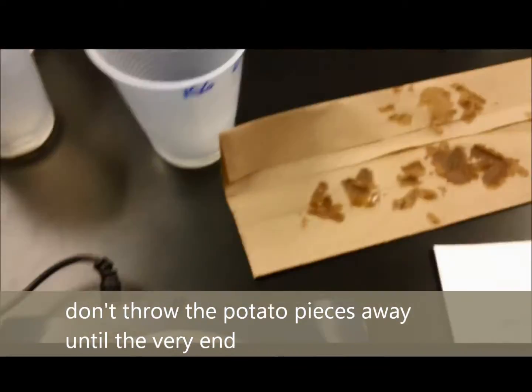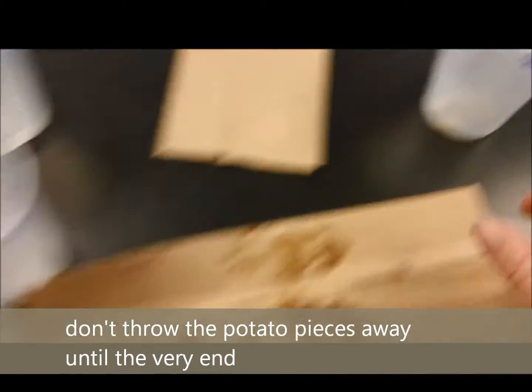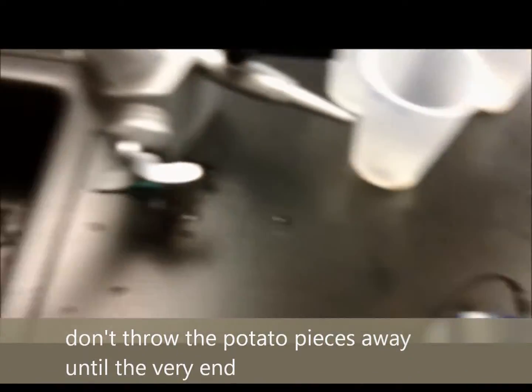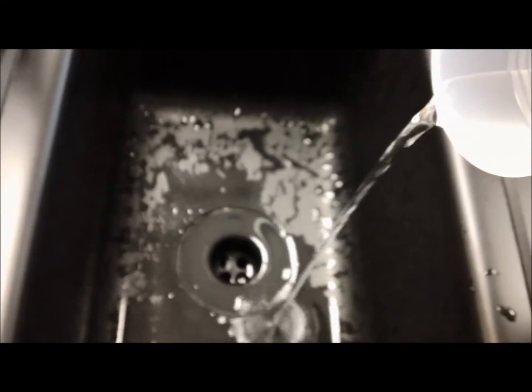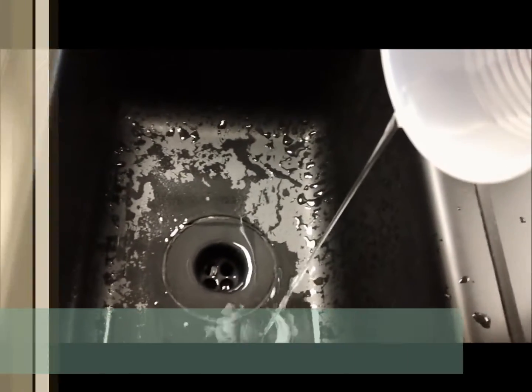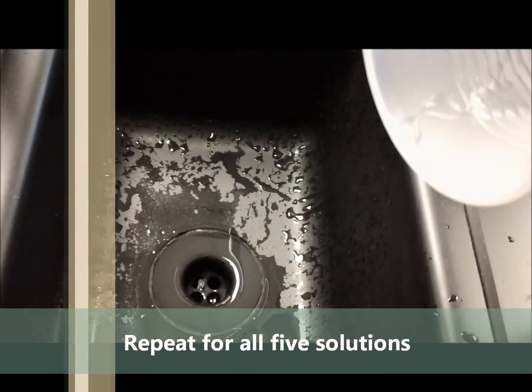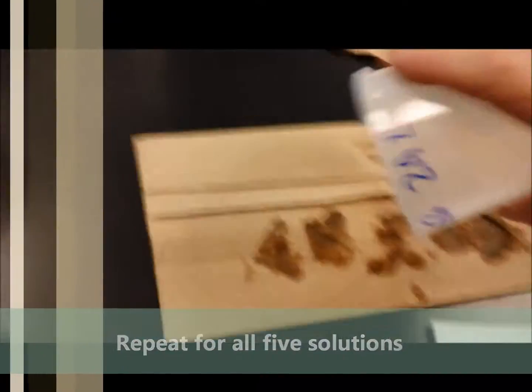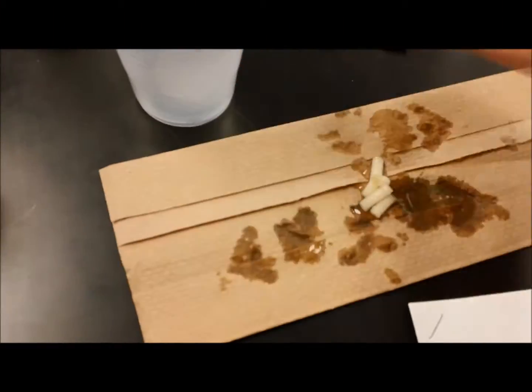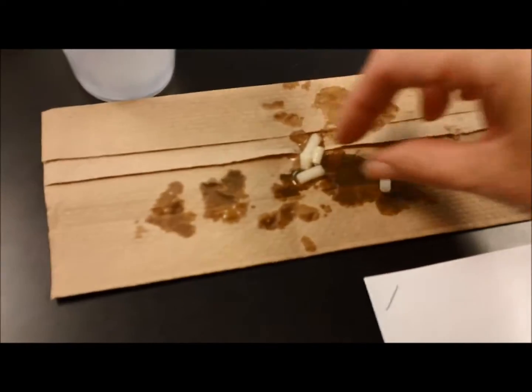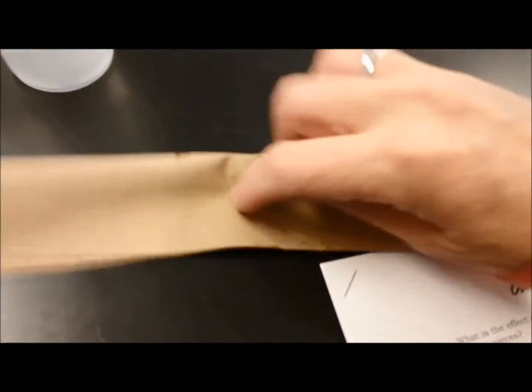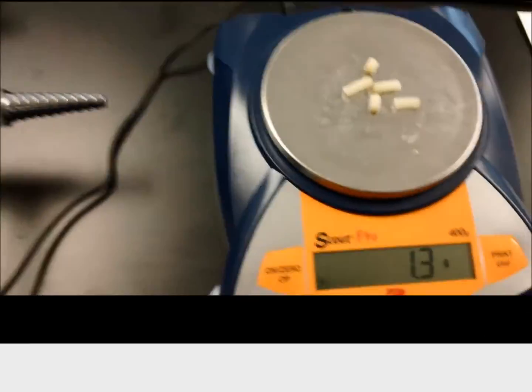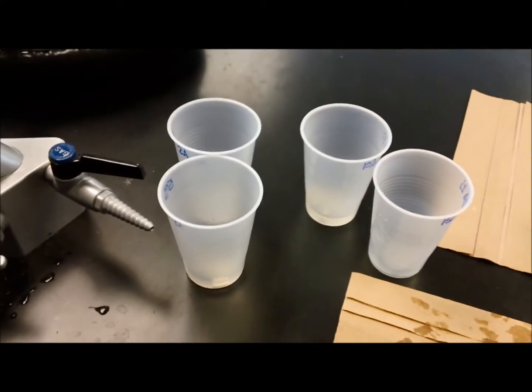We'll put these back into the cup just in case we need to weigh them again later, maybe if somebody in our group wasn't paying attention or didn't get the weights. Now we're going to do the 15%, and again we'll pat them dry because we don't want to weigh the water weight. We'll continue this with our other three.